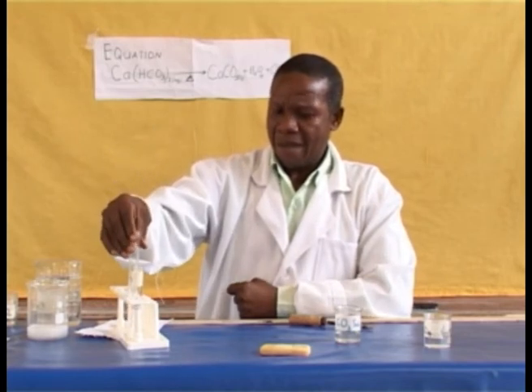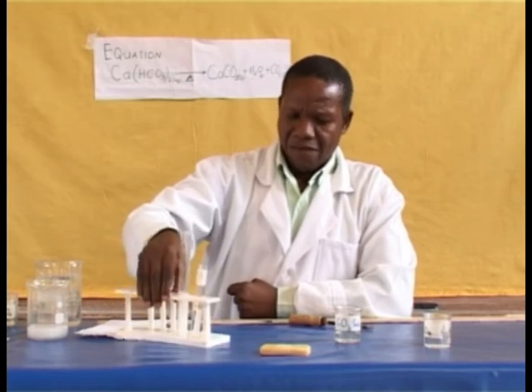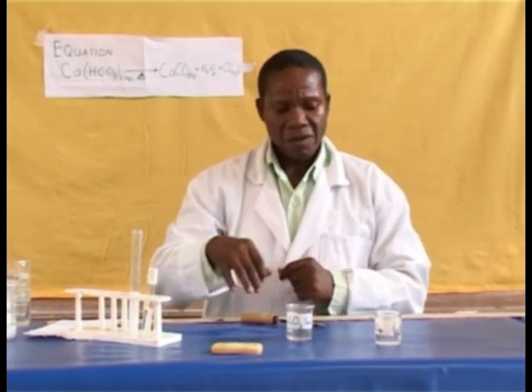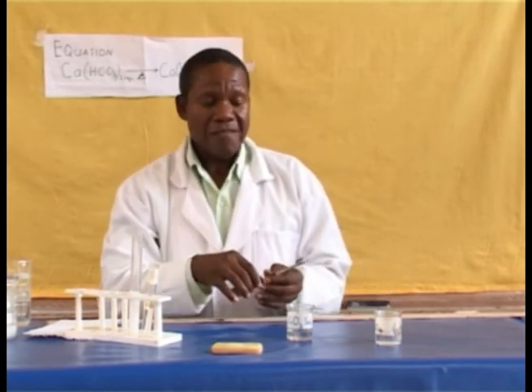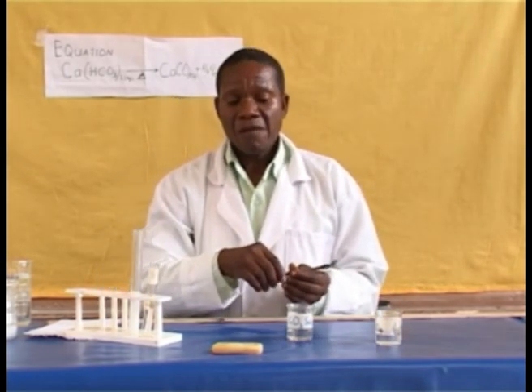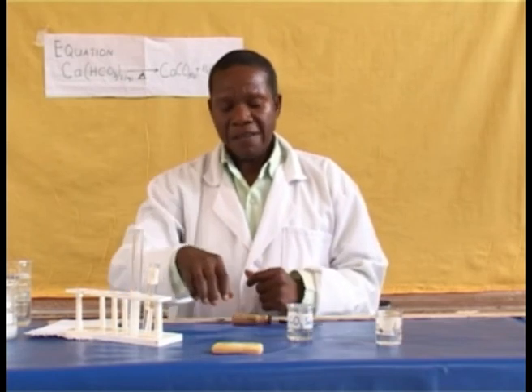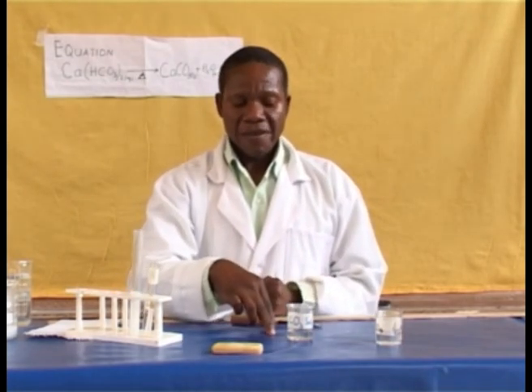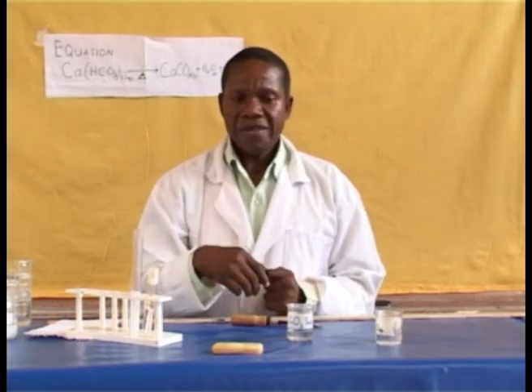Now, the calcium sulfate solution at first did not form lather with soap. Now it forms lather with soap after reacting with sodium carbonate.